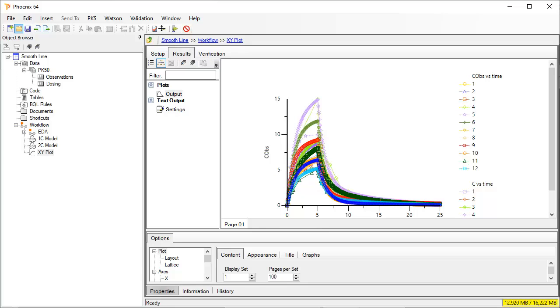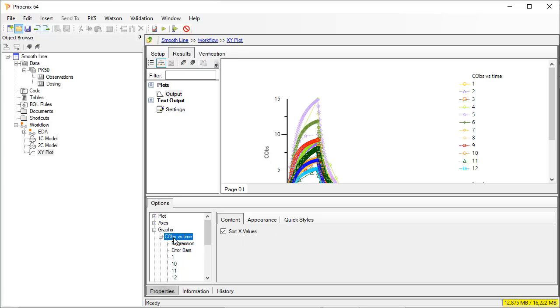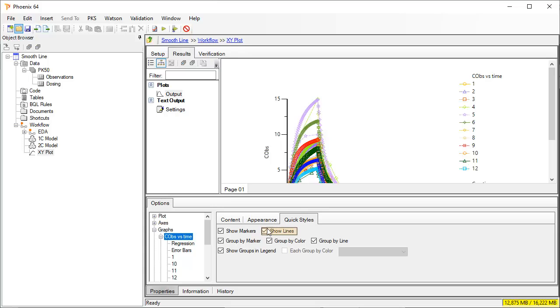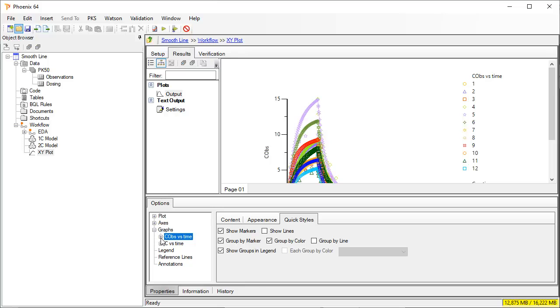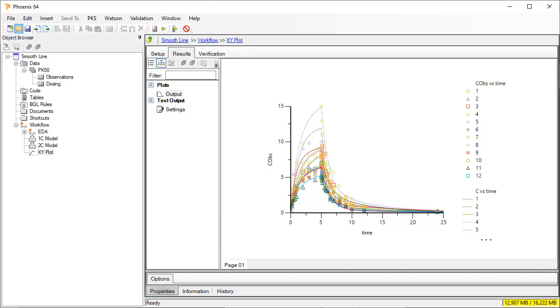We will clean up this plot a bit. We remove the lines from the observed data by selecting Quick Styles to show no lines. And for the predicted concentration we select to remove markers. This plot shows a smooth line for the predicted concentrations and it can be formatted further as desired.